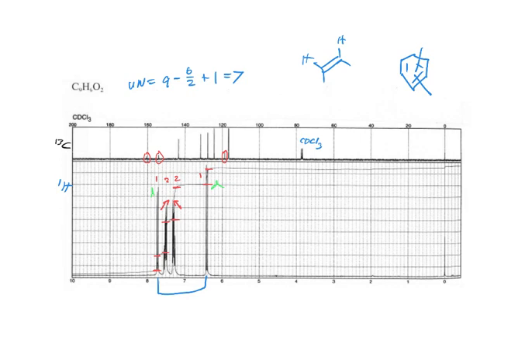So I would say that it's likely not para. Then ortho, because para would be more like doublets. And I think it would be much clearer. The other thing we could say, okay, we've come up with how many? 5 unsaturations so far. How are we going to come up with the other 2? You can have ketone or carbonyls.